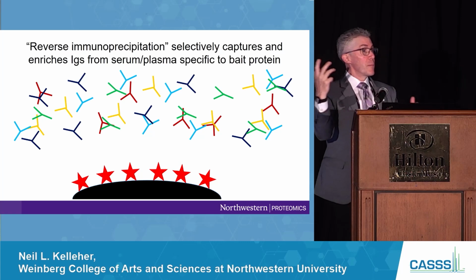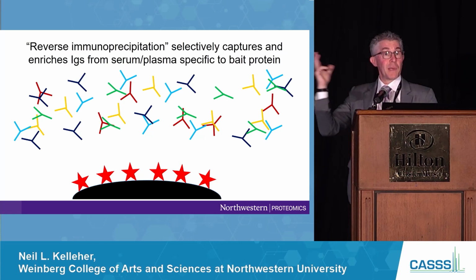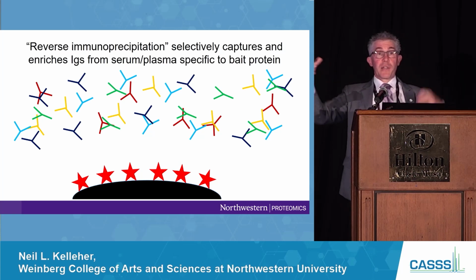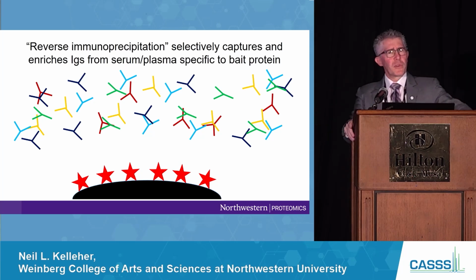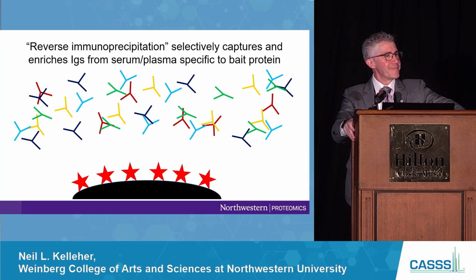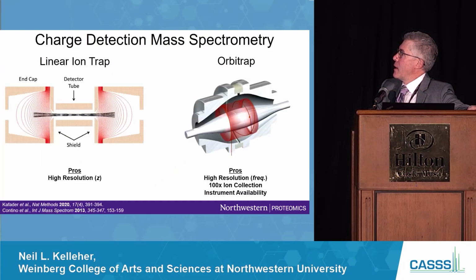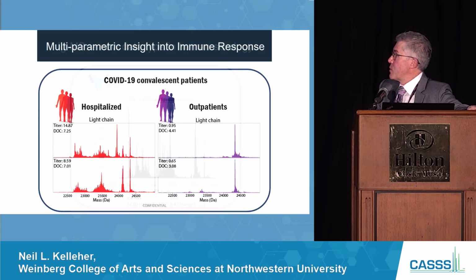So if you put certain possible bacterial epitopes that are really upsetting someone's immune system, and you could do enough of these assays, into the thousands, tens of thousands, to see what really lights up in the serum of an autoimmune-suffering 18-year-old with questionable music choices. It seemed to me that it would be possible to multiplex the number of antigens and get a broad array and really have a high throughput screening there. Yeah, that's the industrial version, because of the spectral space available.